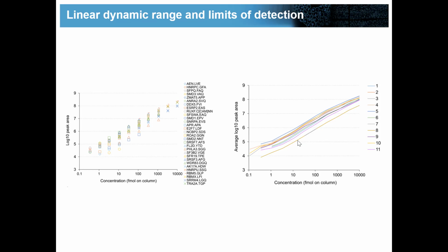And then it re-extracts all of the fragment ions that could be useful for localizing particular isobaric modifications, and overlays these onto the peak group and then scores these using its Bayesian hierarchical model, and gives you some kind of metric about whether the localization is here or there, or whether there isn't enough evidence to say.